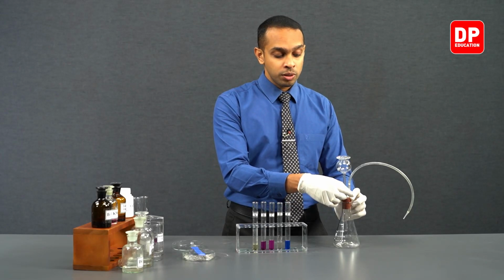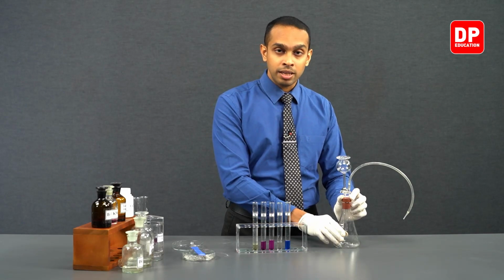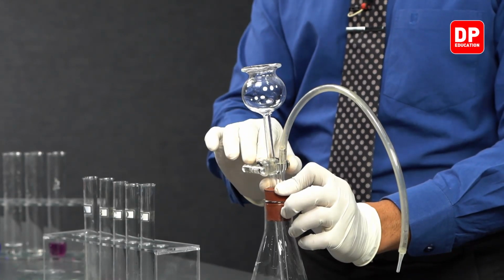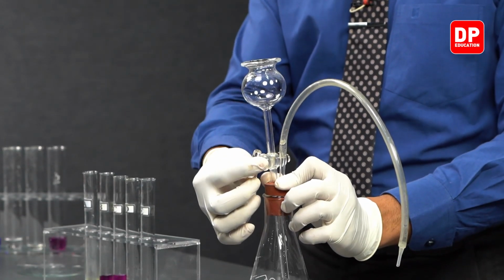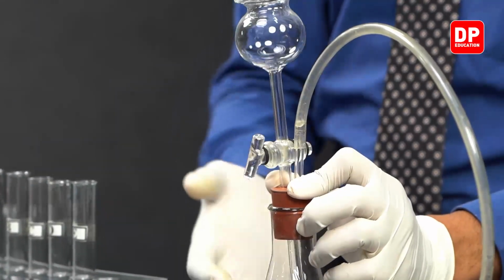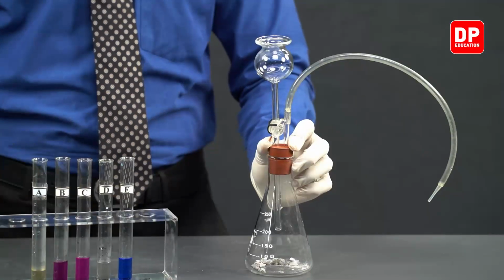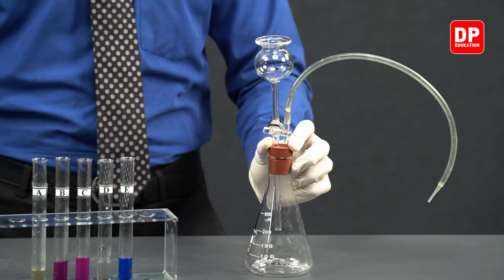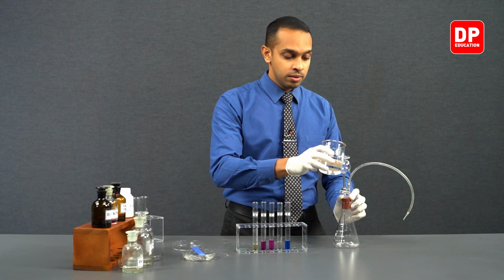So when we add water here, we can open the valve and regulate the water flow into our calcium carbide. To make sure that we do not mistakenly add a lot of water to the calcium carbide, we will start with the valve closed first, and then afterwards we will open this valve and allow water to gradually fall onto our calcium carbide. So let's first of all close this valve, and we can take our water.